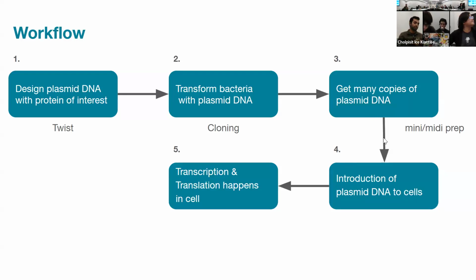And I was explaining actually a few of those yesterday. Ideally, a lot of these stem from the challenges we have: a gene of interest, either from nature or from other items that people have identified, and we want to put it into a chassis or an organism of interest. So this is the workflow you want to know.